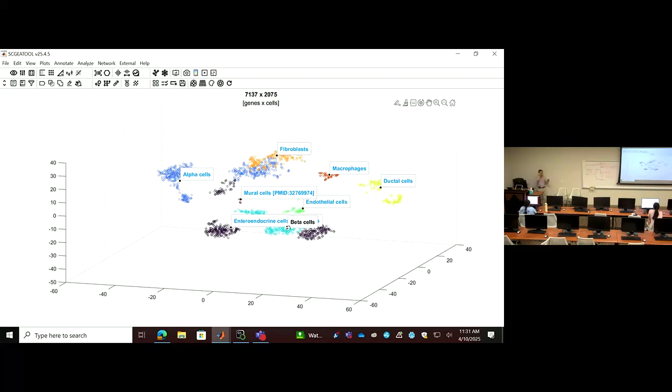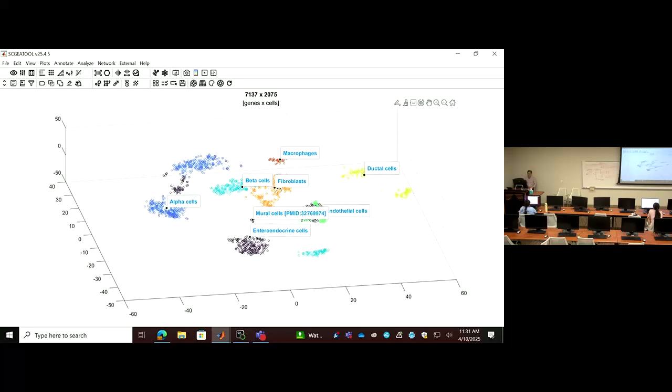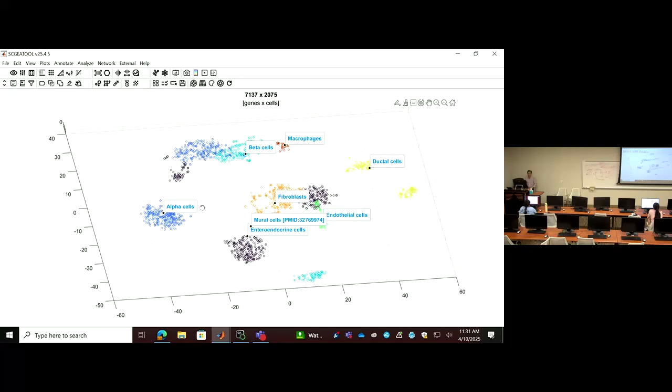You don't want to build a trajectory that jumps from alpha cell to beta cell because it doesn't make sense biologically. So we need to find a potential trajectory. I believe we have enough alpha cells. Also, for alpha cells, you have 2 different time points: this is 8 weeks, this is 14 weeks. So probably we can model the transition from the early weeks to the later weeks.